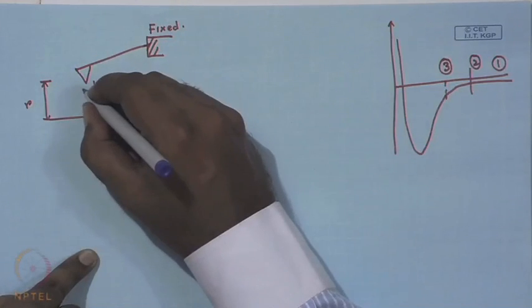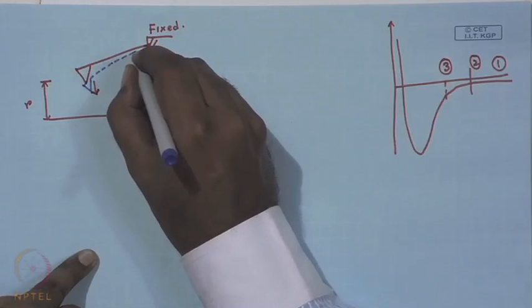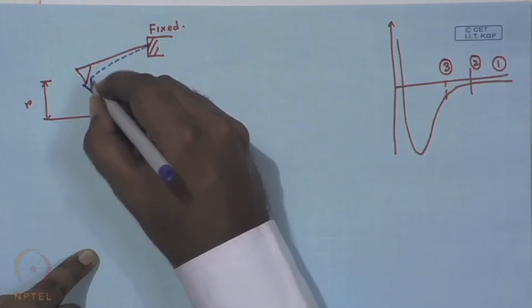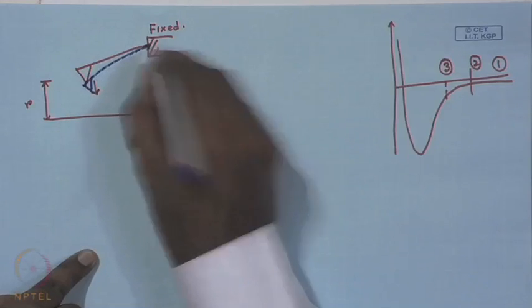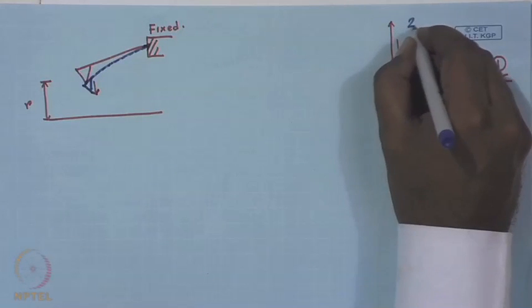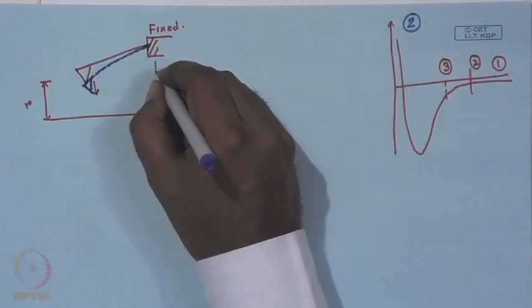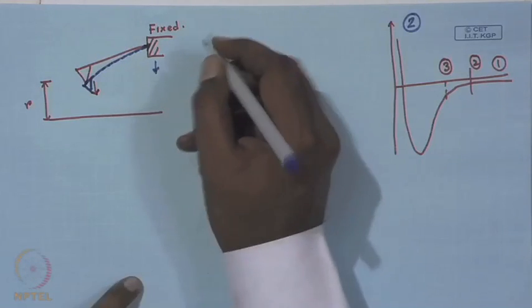So, what happens is the tip starts to bend like this because of the attraction it feels from the approaching surface. Simultaneously, your vertical motion due to the stepper motor is still progressing.